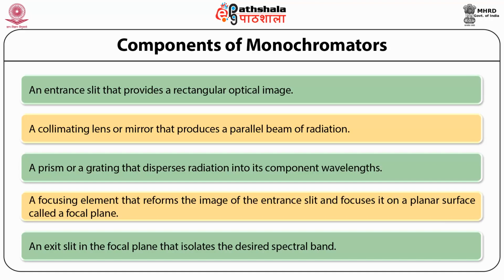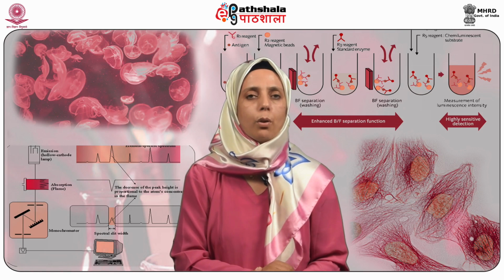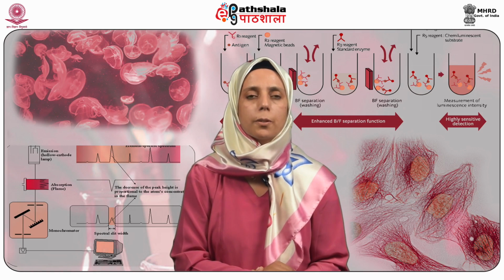In addition, most monochromators have entrance and exit windows, which are designed to protect the components from dust and corrosive laboratory fumes.